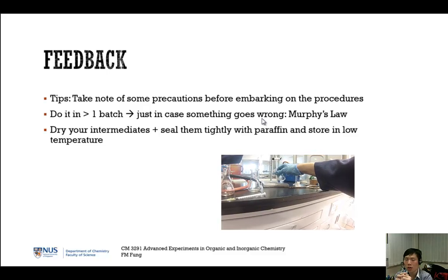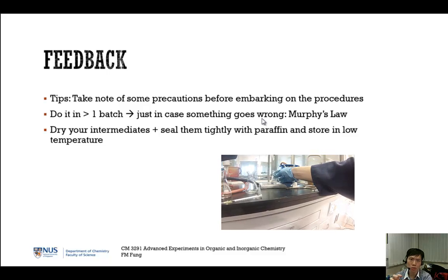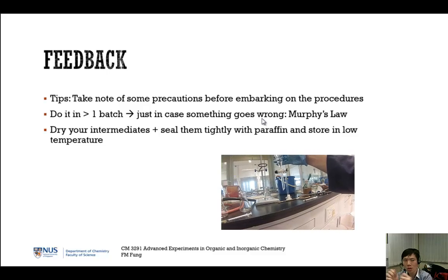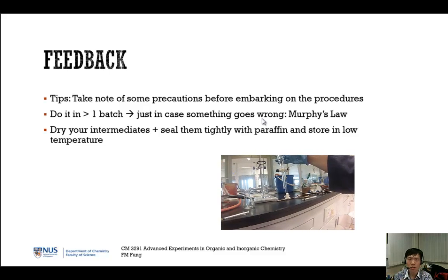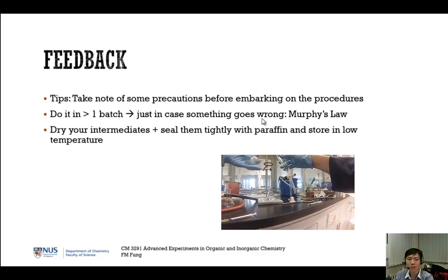And then you put the stopcock, or you can store inside a vial, which is in fact more preferred, because a vial is rather small and compact, and you have less chance of storing other vapor. Again, paraffin it, and store at low temperature. If there's a freezer, store in the freezer. If there isn't a freezer, store in the fridge. Your lab officers will guide you.